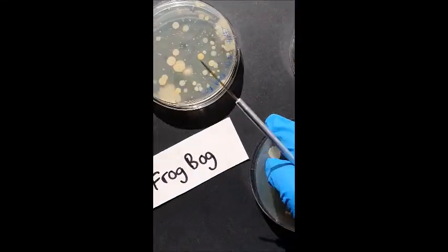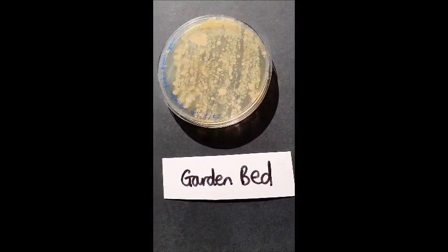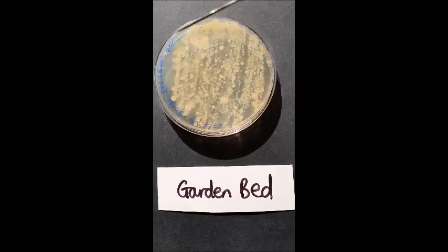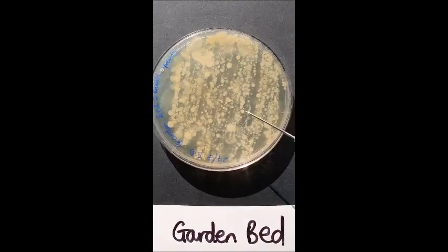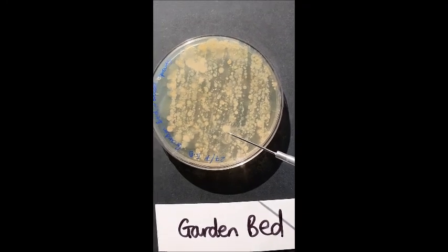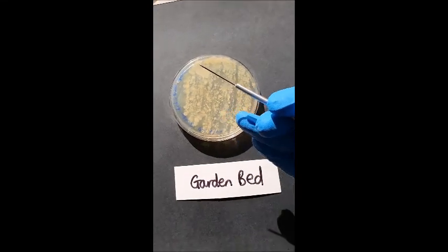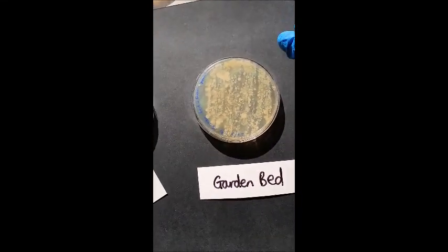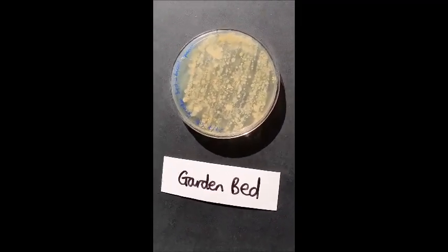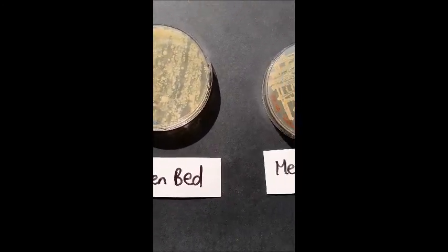And then look at this one. This is from a garden bed in the kitchen garden. It was the bed with the Brussels sprouts in it. I just got a swab and rubbed it on the Brussels sprouts, and this is what came off. There is so much bacteria, like good bacteria, in your garden bed. It kind of was shocking to me how much is in a natural space that isn't being sterilized compared to, you know, what all of our high human traffic areas look like now that they're getting sterilized every day. Something to think about, but you know, again, comforting because obviously the sterilizing is working.